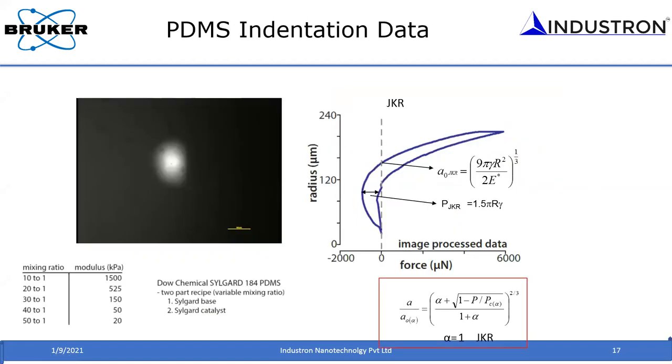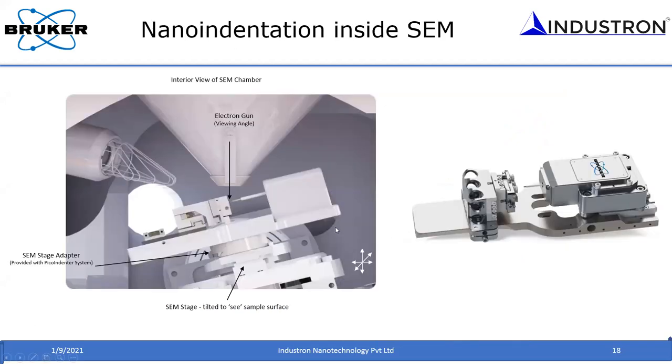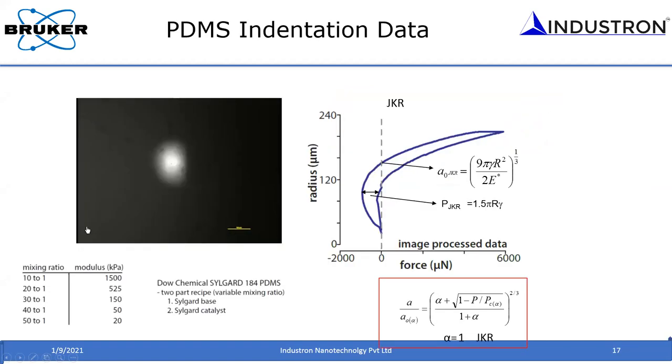From this, you can do a lot of other things, for example, in combination with the optical microscope, I mentioned that you can see directly. In this case, this is a PDMS. The tip is approaching. You can see the contact formation, and this is done in situ. At the same time, you're getting the load displacement curve. But from this video, you can also extract the size of the contact as you apply the force. That size of the contact is what is being plotted over here. With that information, in addition to models, you can also measure the pull-off forces. From that, you can measure what is the surface energy and things like that. So it kind of adds up.